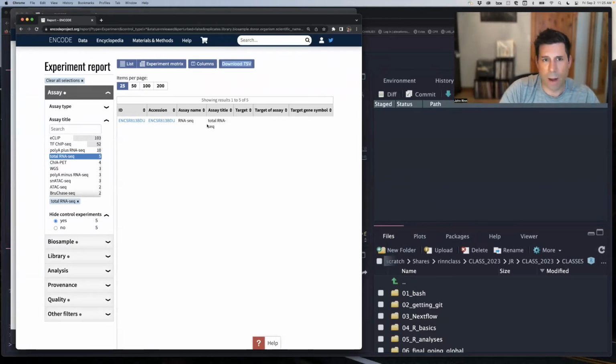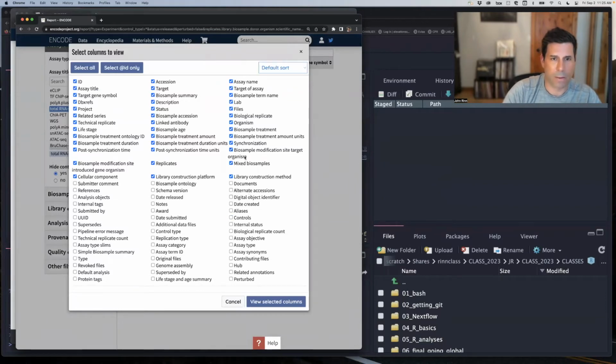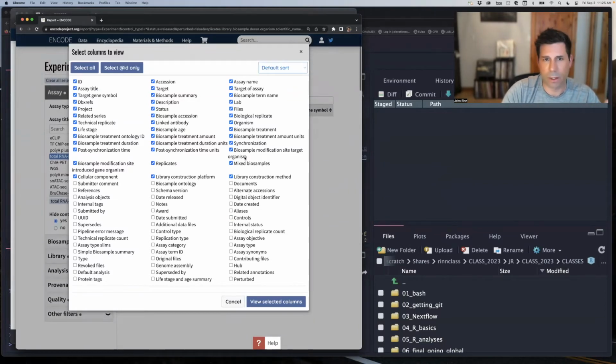which will say if we downloaded the files properly from ENCODE, they don't have that button here. And so in columns, you can click things and get things like controls here. We don't need that for our RNA-seq, but for ChIP-seq, you might want that for the inputs. All kinds of different things you can sort by, but MD5 sum is not one of them.